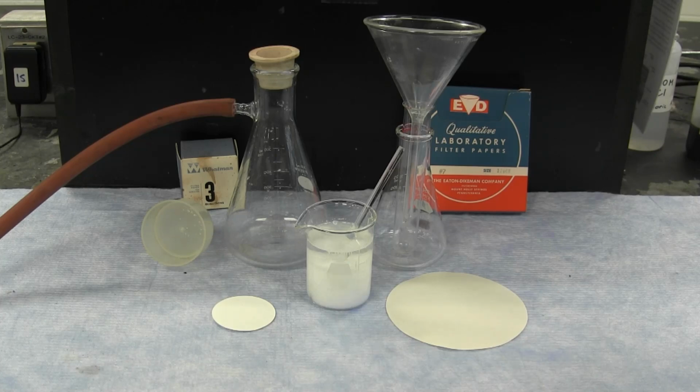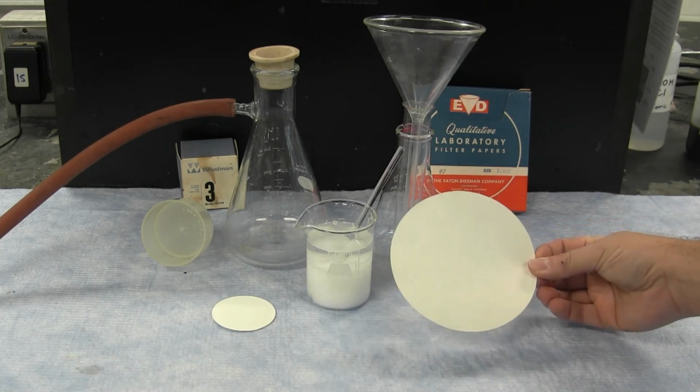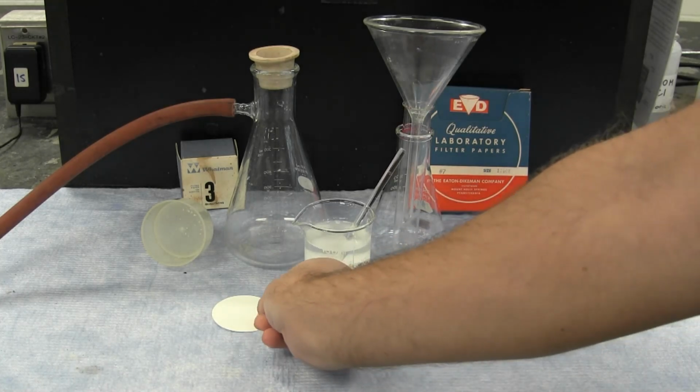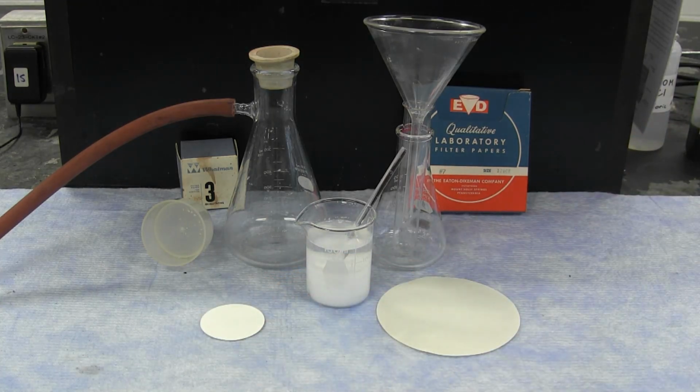In both instances, the filter paper is provided in circular sheets. The difference between the sheets and how fast the filtrate can pass through it depends on the pore size and the packing of the filter paper itself. How tightly woven are the individual fibers, and how thick is it?